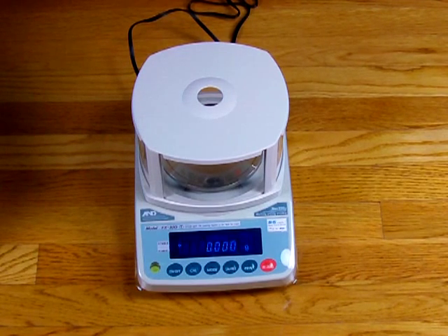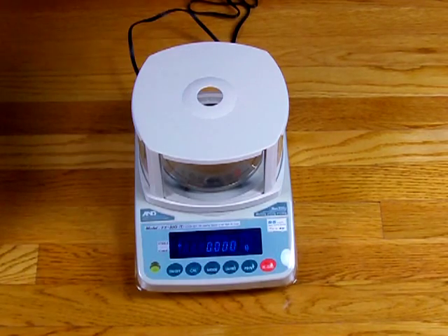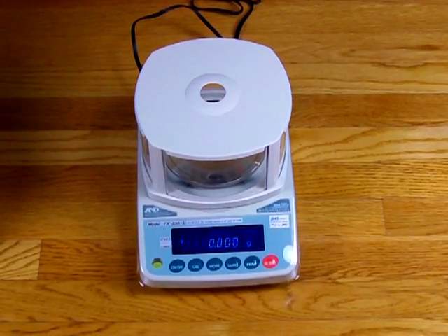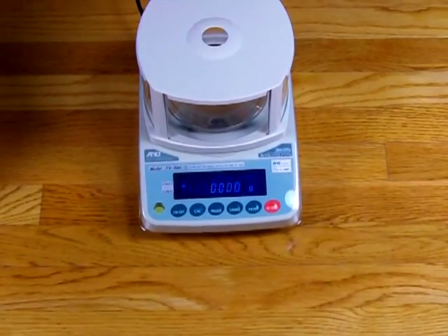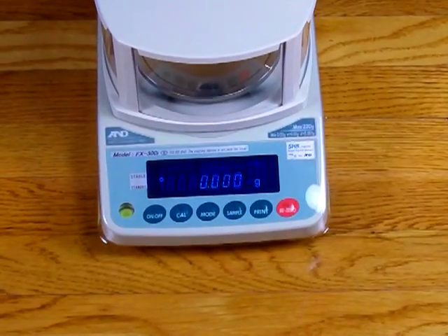This is the legal for trade version of the A&D milligram balance. It's a little bit different, so that's why we're doing this video. On most A&D balances, to calibrate you simply press the CAL button and the balance calibrates. On this model it's legal for trade, so they lock it out. That's one of the requirements for legal for trade — if you press the CAL key, nothing happens. If this was the non-legal for trade version, you would simply press the CAL button and go through the calibration procedure.